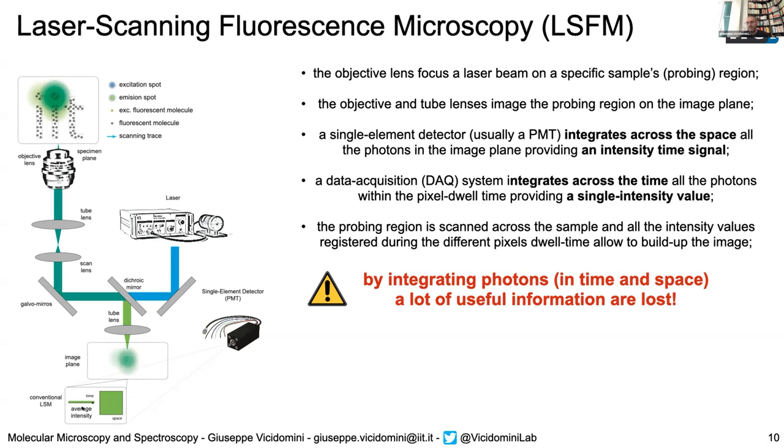So we are living in the era of single molecule, and you know what happened when people were able to move from ensemble techniques to single molecule. By stopping averaging, a lot of information came out. The same thing can happen here if I stop making a spatial and temporal integration of the signal that comes from the probing region of my system. So I can solve this problem.